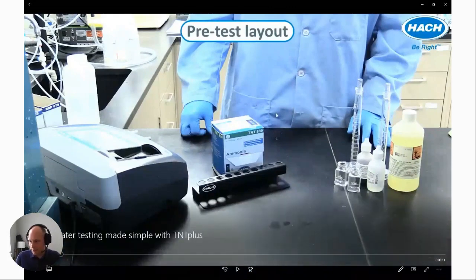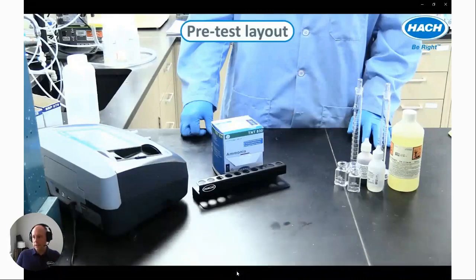So this is my lab. This is the TNT plus reagents over here, and this is the traditional ammonia reagents over here, and this is the DR 3900 spectrophotometer, which we can use to measure either way. So I'm just gonna talk over this.